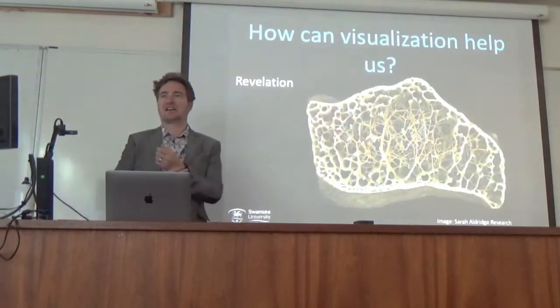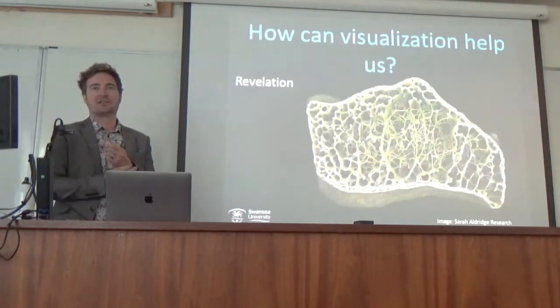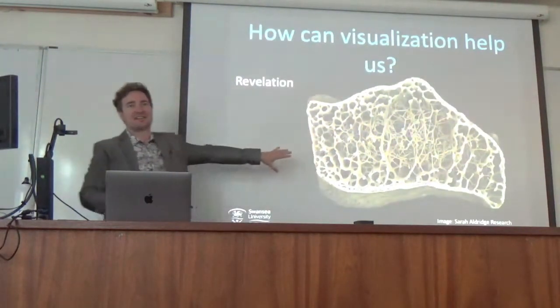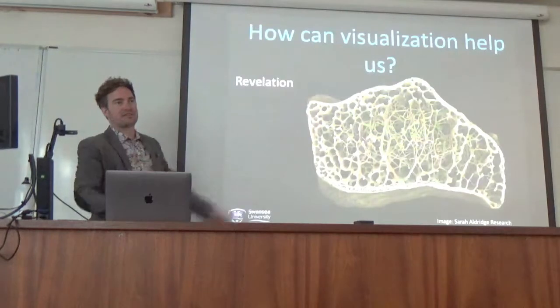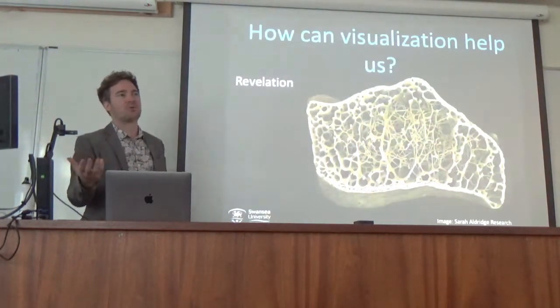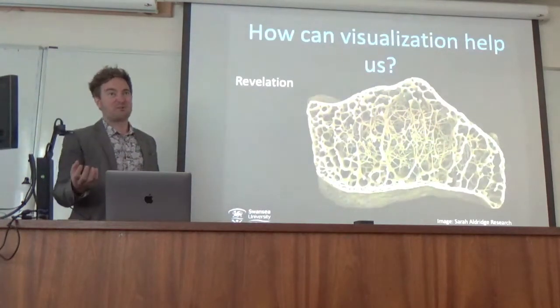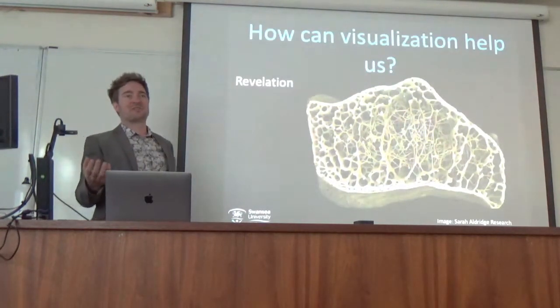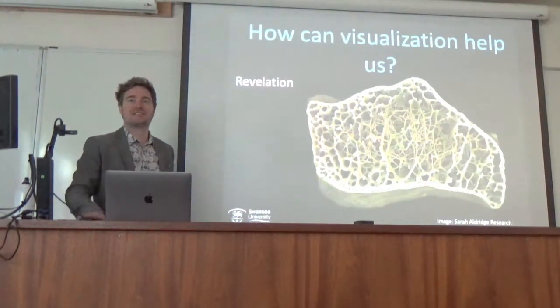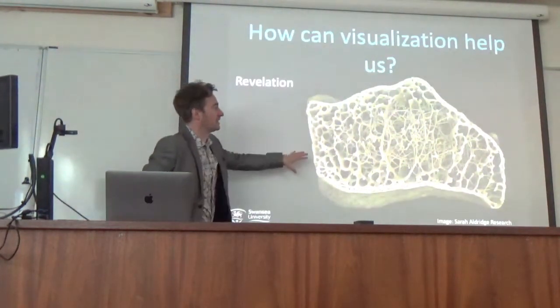You've seen x-rays or CT data of wrist bones loads of times, but what she's done in the software and the visualization side of this, that's what won her the image award at a conference this week, because it's just striking. It's just bone, right? Everyone works with bone a lot of the time. It's not the most exciting of materials. I think it's pretty awesome, but people are used to seeing it. But the visualization on this makes it pop.